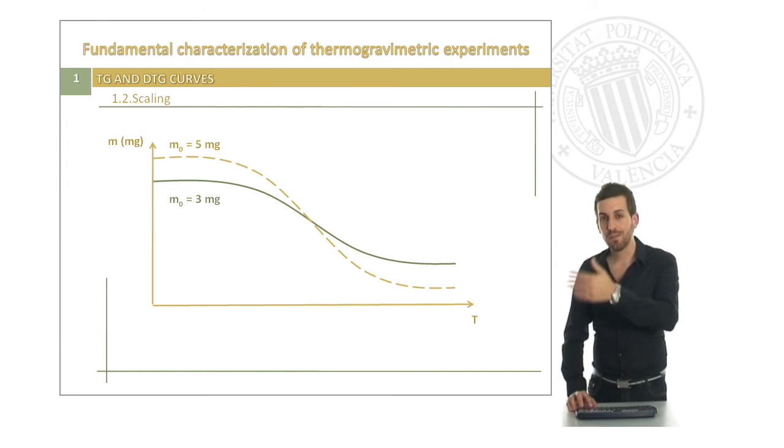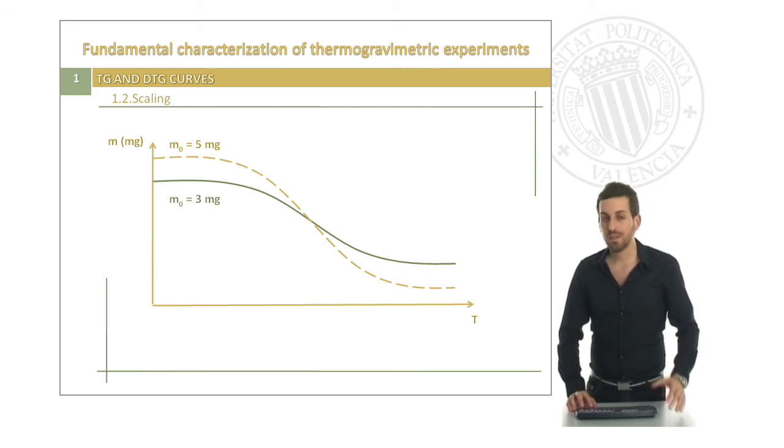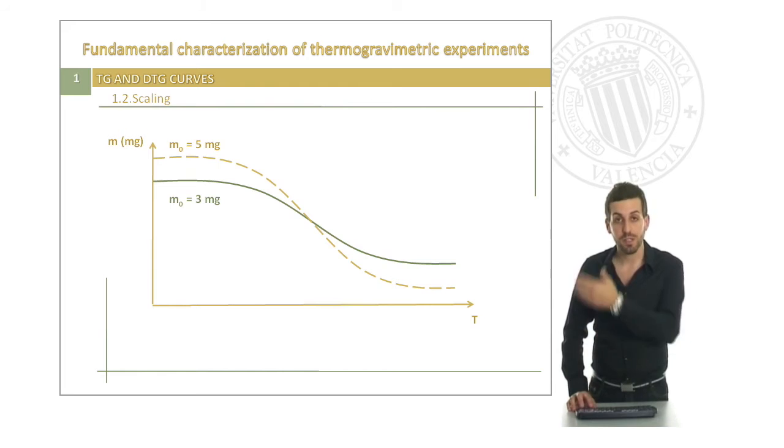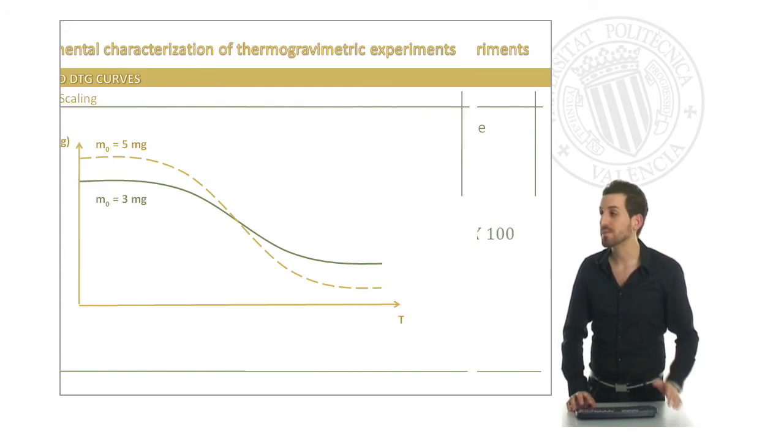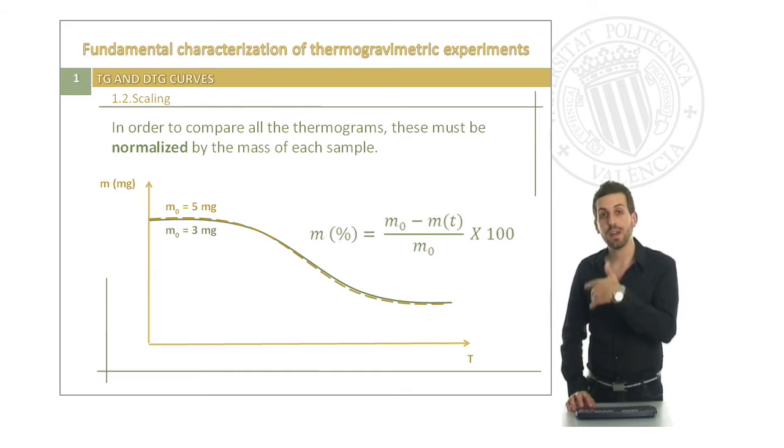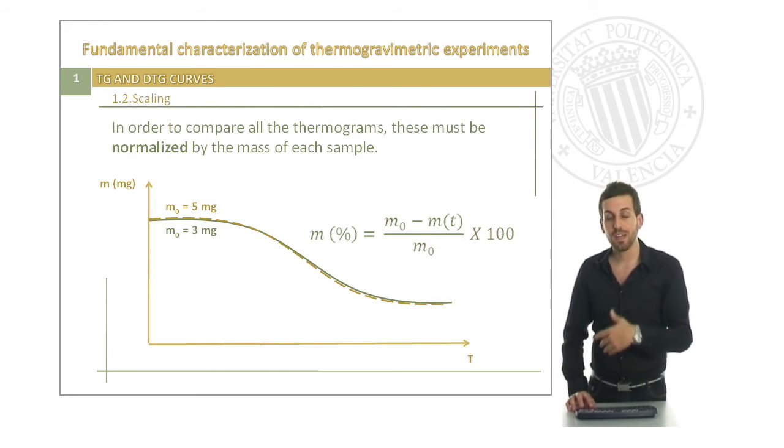Let's start playing with these TG curves. The first tip, the first advice that I can give you is that if you have different samples with different masses, don't try to relate them because you cannot distinguish between both samples. But if you scale them, you will be able to characterize and to relate and to find the different differences between both samples.